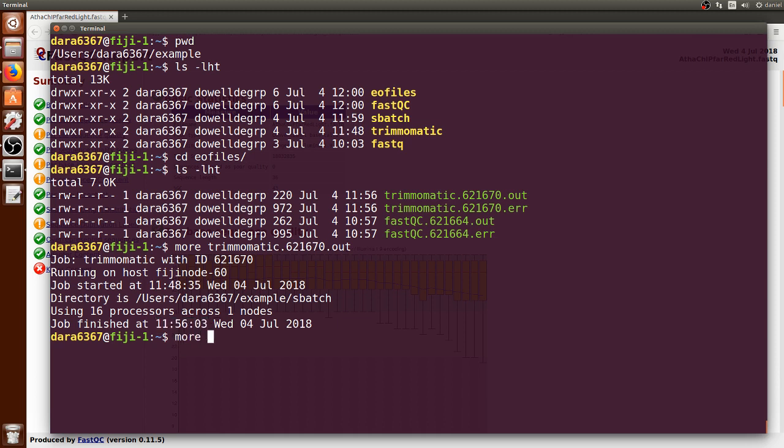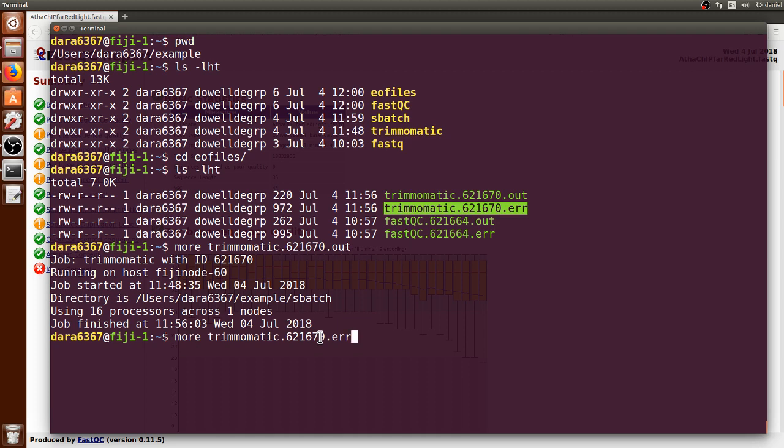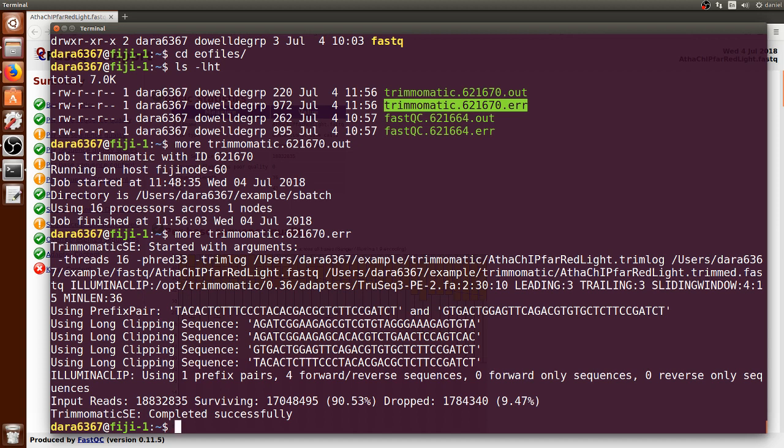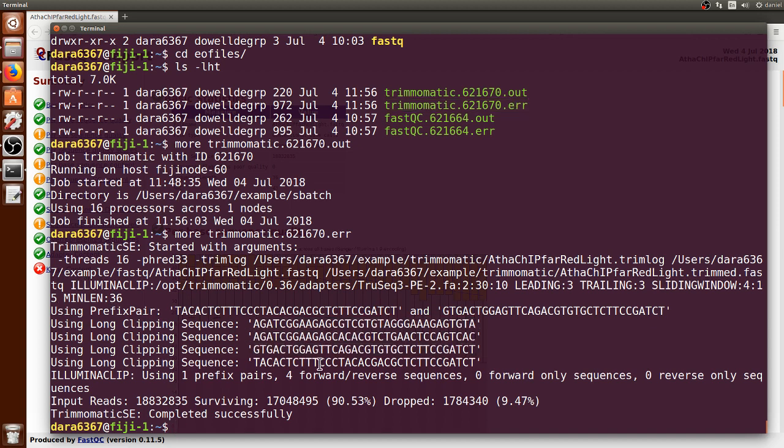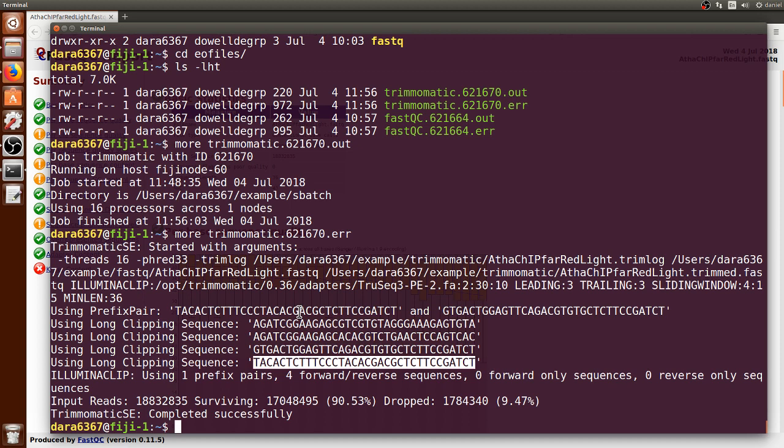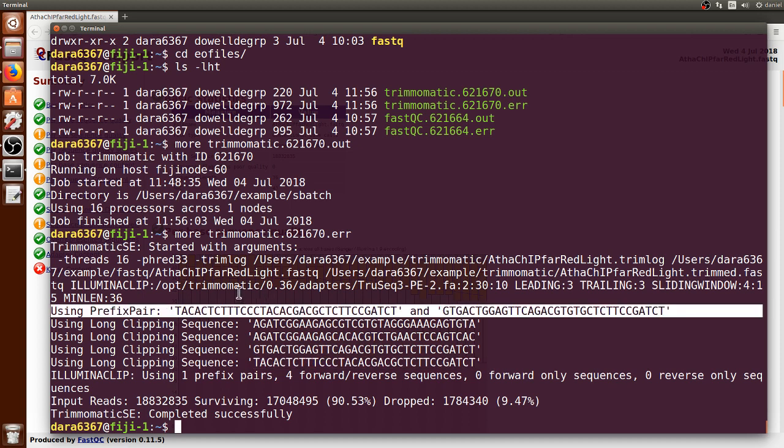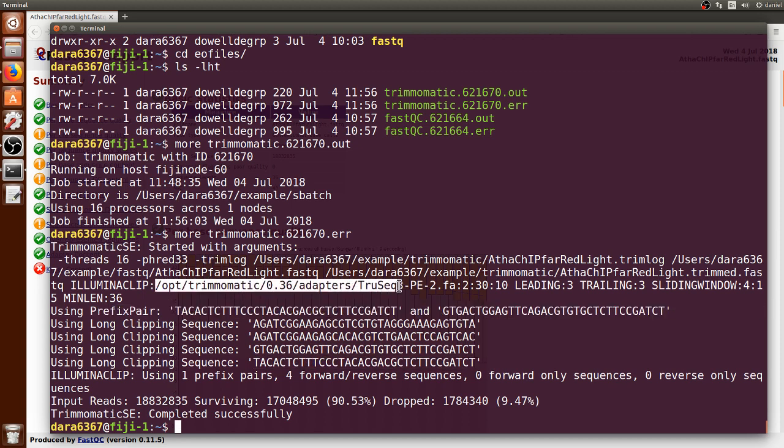We can now go to the error output file. It doesn't mean that it has an error, but rather that it just throws additional information there. We can see that Trimmomatic options that were used and what were the sequences that you gave it for the adapters that lived in this specific directory, the FASTA file.